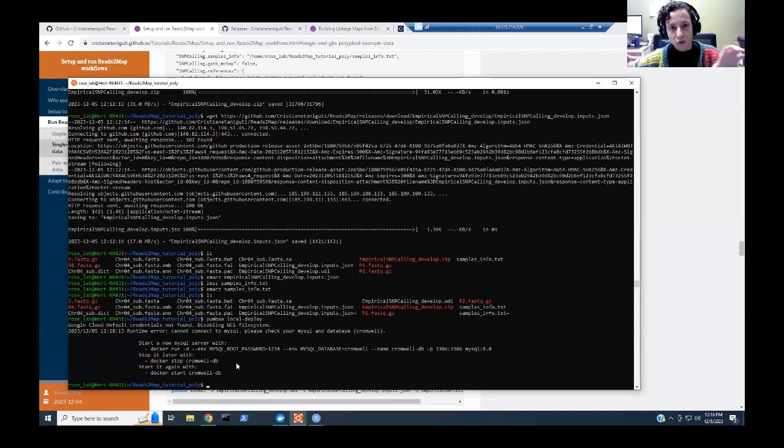It will keep cache for all the jobs that were successful, and we will only rerun the thing that broke. And this is super nice. If you want to change parameters also, if you want to test, for example, just change a parameter in the mapping part, you don't need to run since the SNP calling. You can keep the cache from all SNP calling, genotype calling, and everything, and just change that parameter at the end. So it's very nice to have.